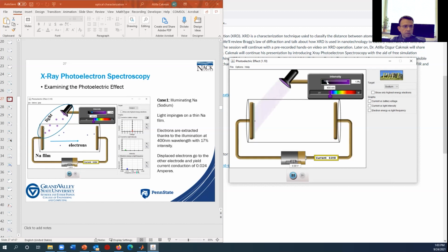I will send some light, some intensity of light. So I'm just shining some light onto an anode here, and I'm getting the light from the material. Sorry, in this configuration, it's turned to be a cathode, but it's not super critical. So we're extracting some electrons here with the intensity.